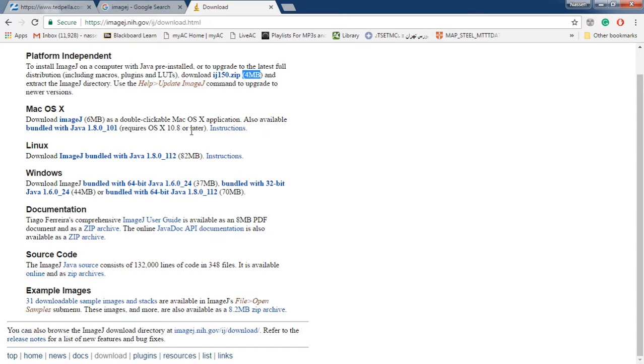And the cool thing about it is it doesn't require regular installing. Okay, it's a portable software, so it comes with a directory. You just click and go into that directory. You click on your executable file, and then you will run it. Okay, so I've done that, and you will download this link. After the initial download, it comes with an instruction.